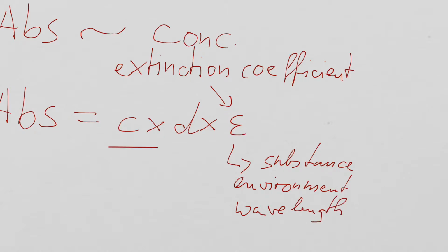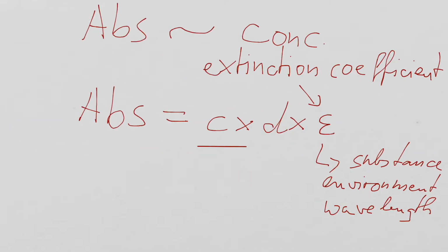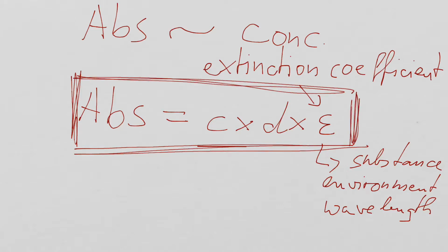And what we have here is actually an extremely useful equation. Absorbance equals concentration times length of the path times extinction coefficient.